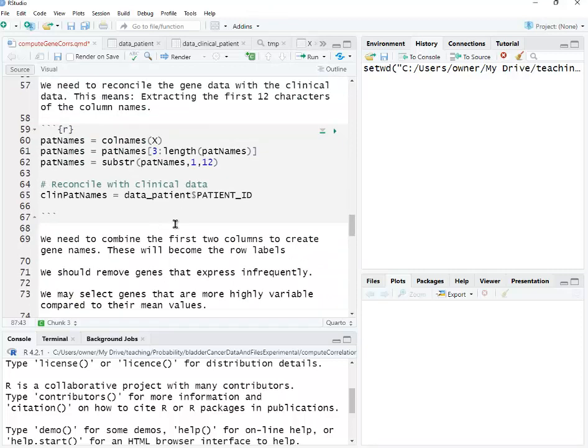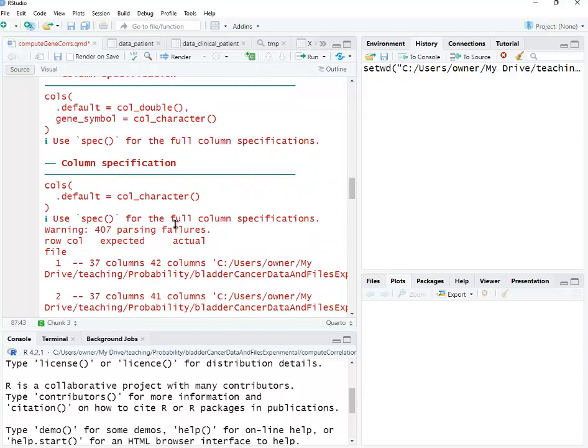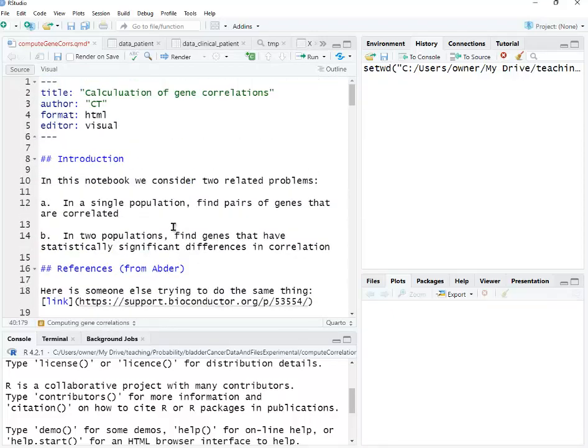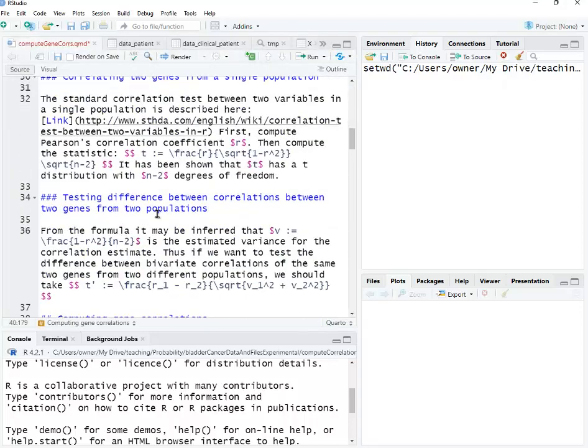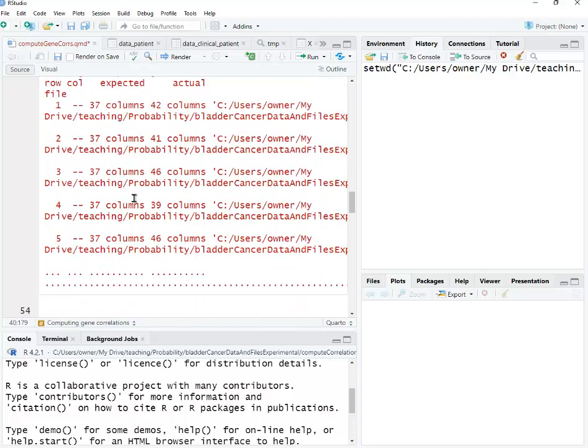And actually, we should also select the males. Let's see if we can do that. I should set n min at the top. Do we have parameters up here? Well, I guess I'll just have to set it there.